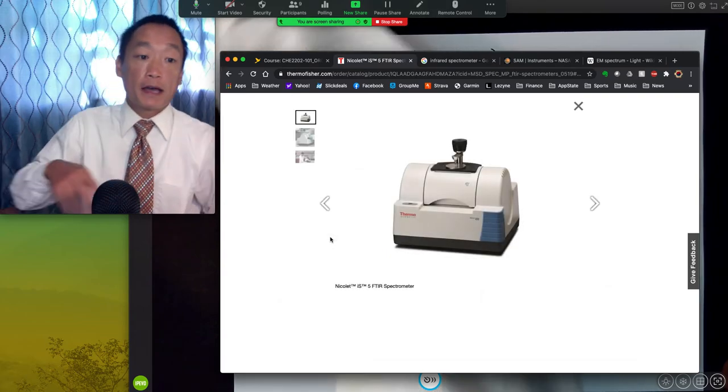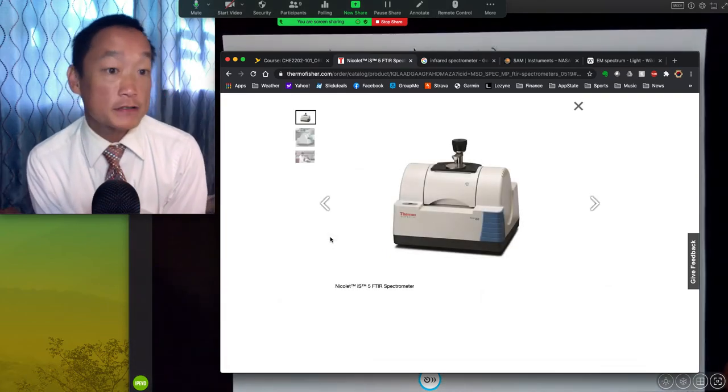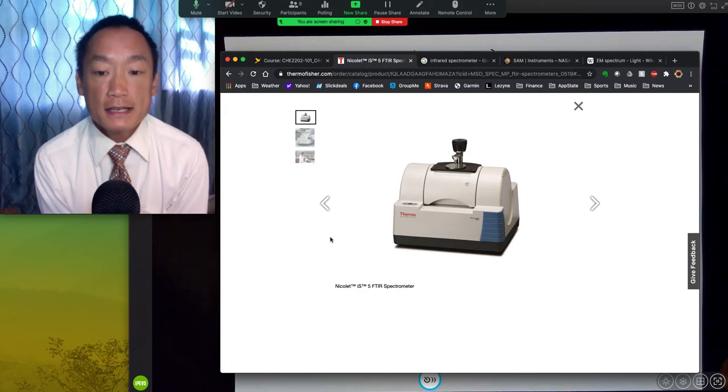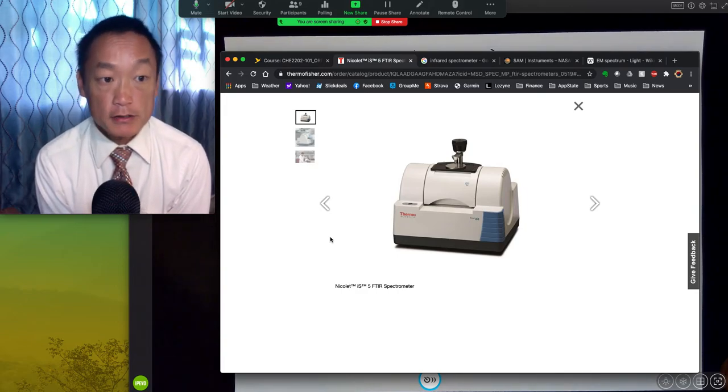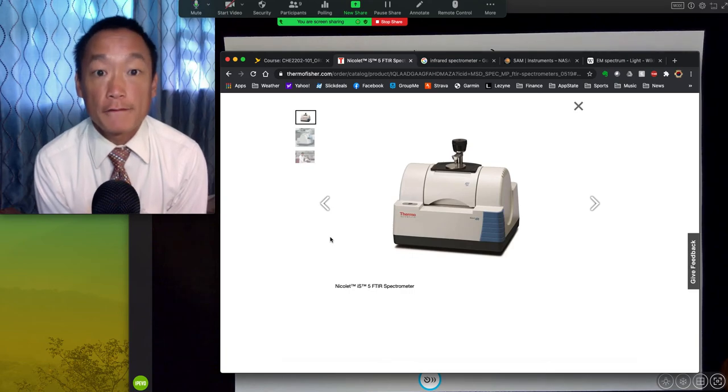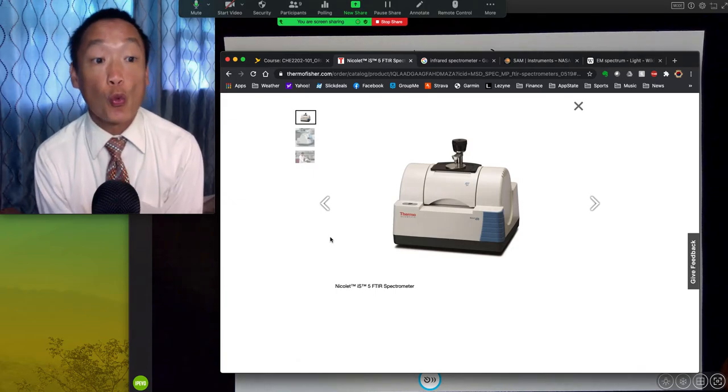And keep in mind, I'm going to say this. Please remember this part right here. It won't really show up on an exam, but these things are called instruments. You guys are all scientists now. And so instruments are things that take a reading of a sample. Machines are things that take energy and convert it into work.